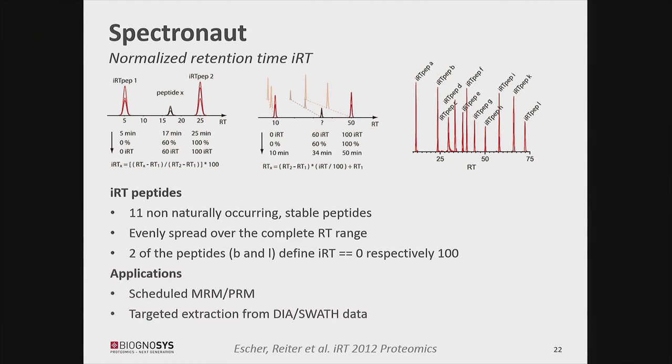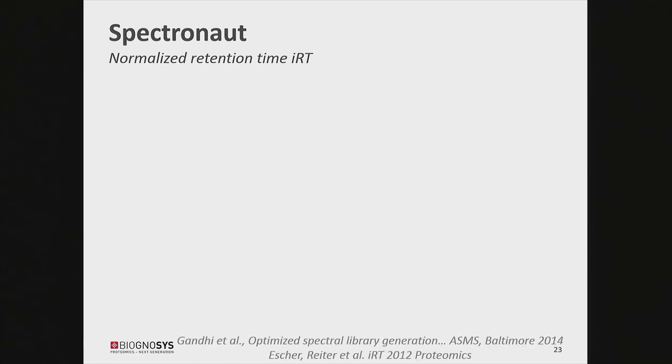And now how can you use that? In the beginning, we used it a lot for scheduled MRM, because if you schedule, you can measure more peptides. You can use the same concept for PRM, of course. But you can also use it for targeted extraction for DIA data. This is what we started to use it for right afterwards, and implemented it into Spectronaut.